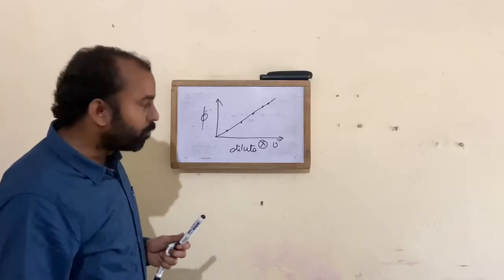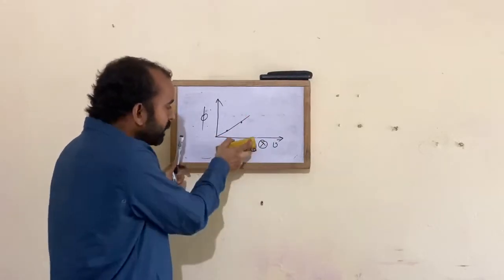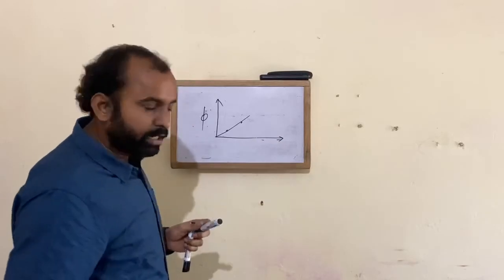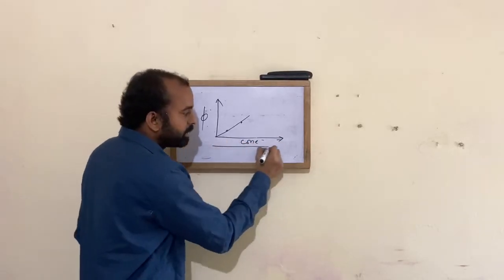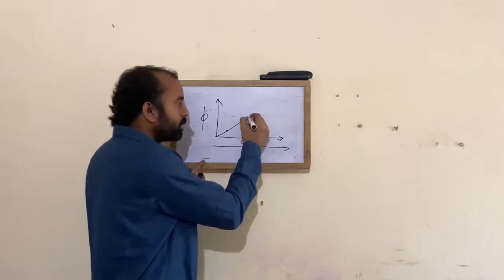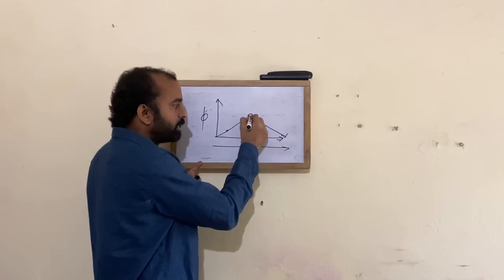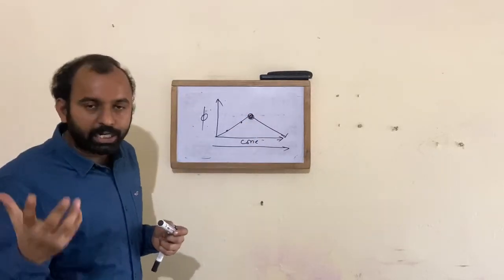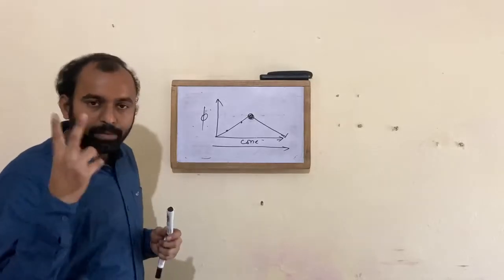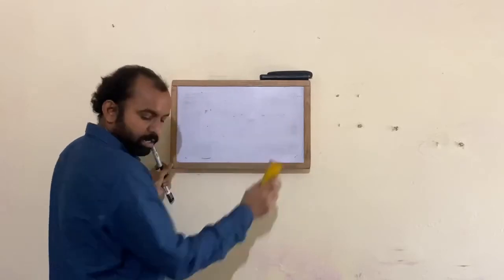However, when you go to higher concentrations, if you take this graph as concentration, as the concentration is increased, the fluorescence level decreases. So this type of quenching of fluorescence by concentration is of two types. Let us see what exactly the quenching is.